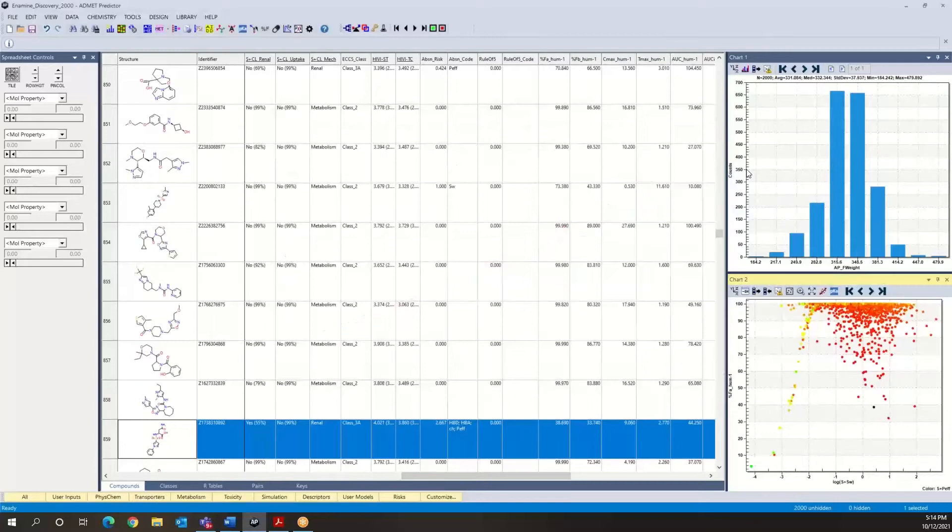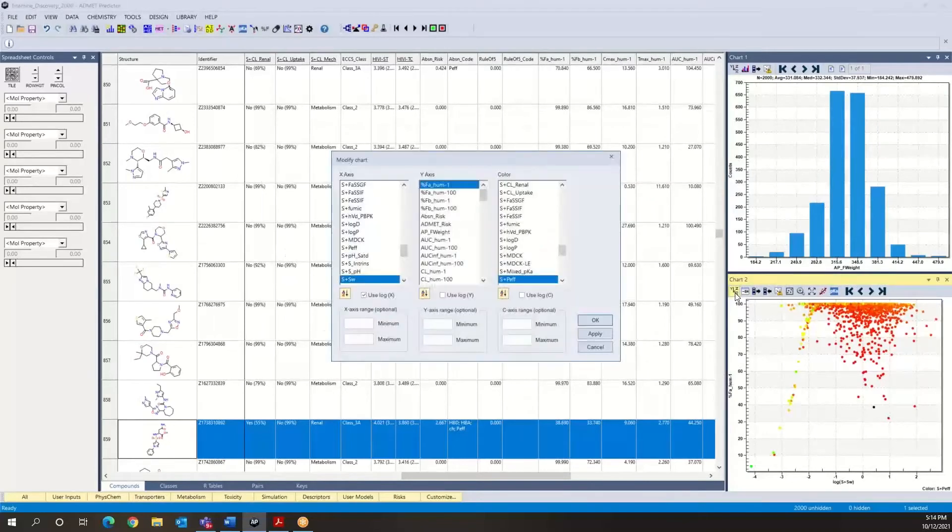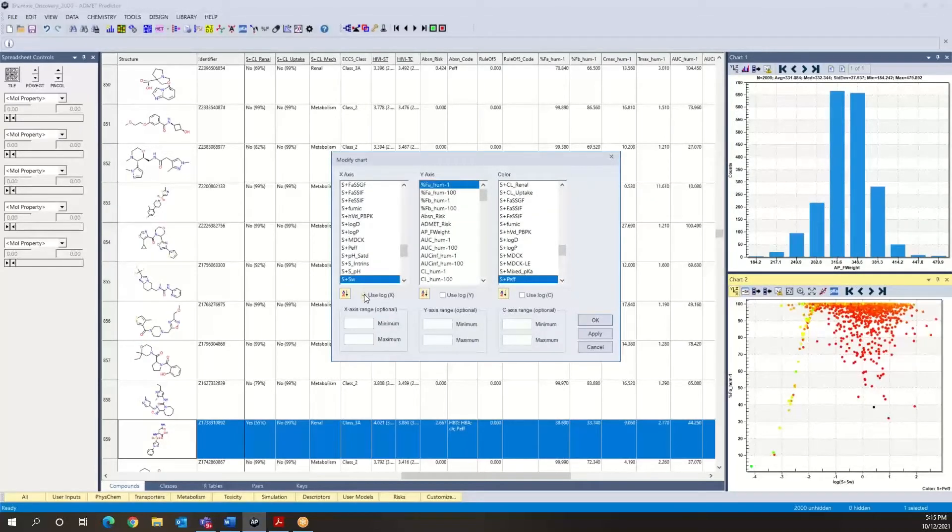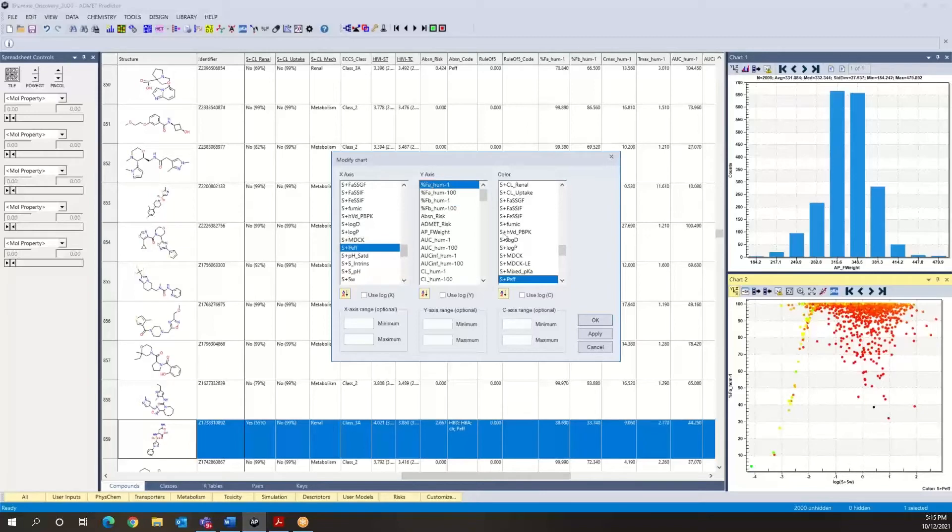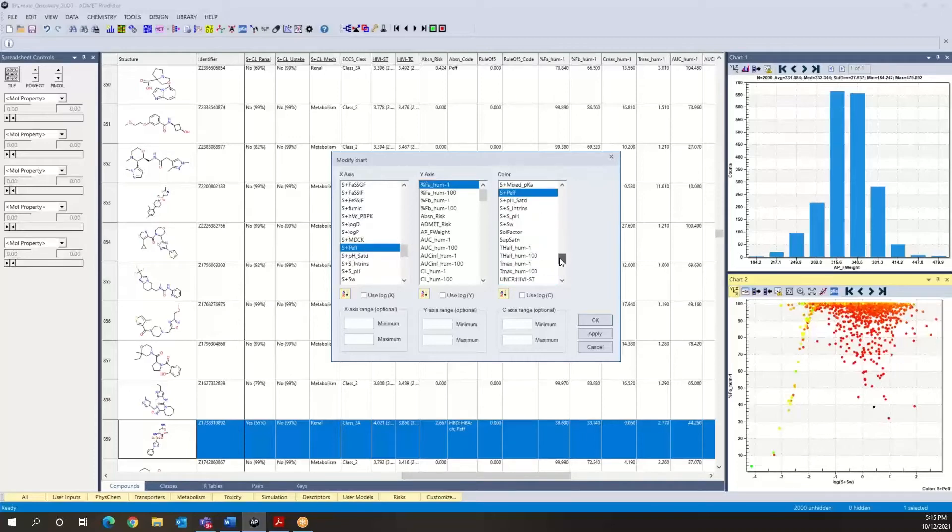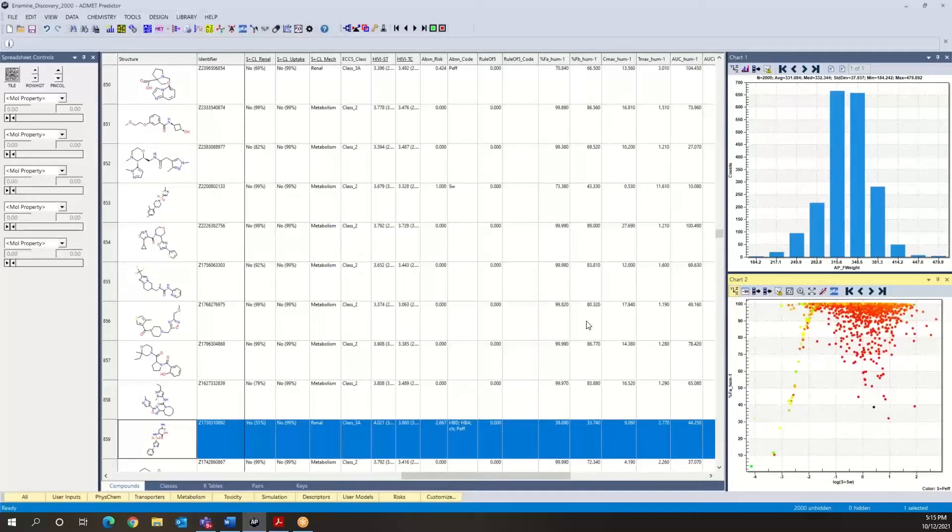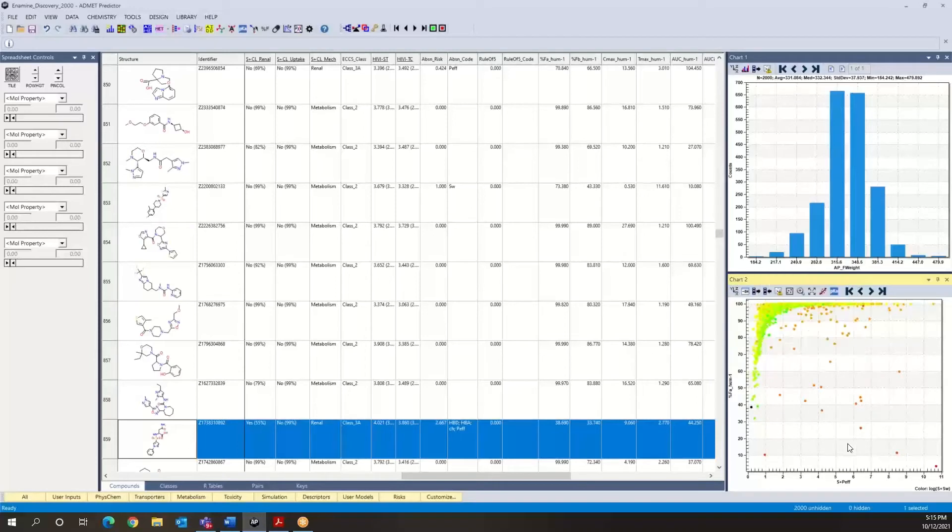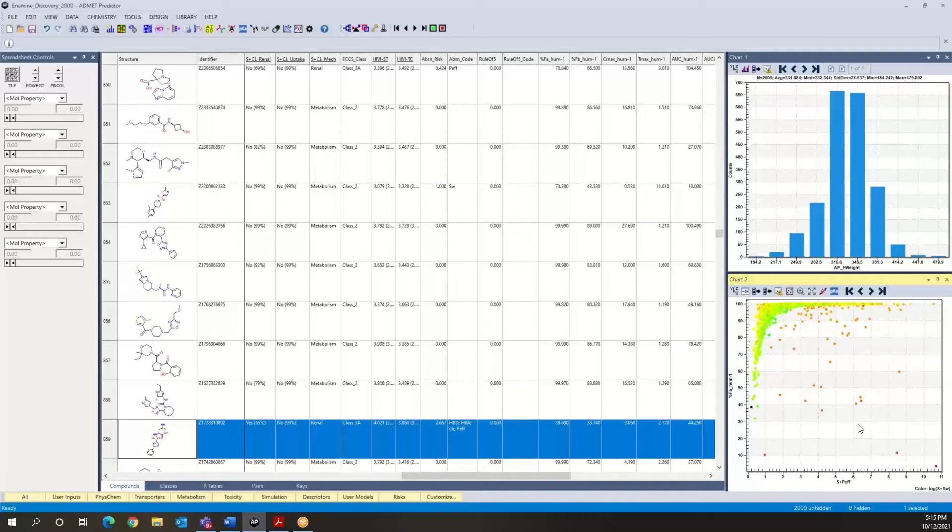Now we can close this one and actually go back to the graph that we had previously. Remember that we had the inverse graph before, where we had graphed percent FA as a function of the jejunal permeability, and we had colored all points with solubility using a log scale. That's the graph we had before. And what we see is that in this case, we have compounds which we project—these are projected to be solubility limited compounds.